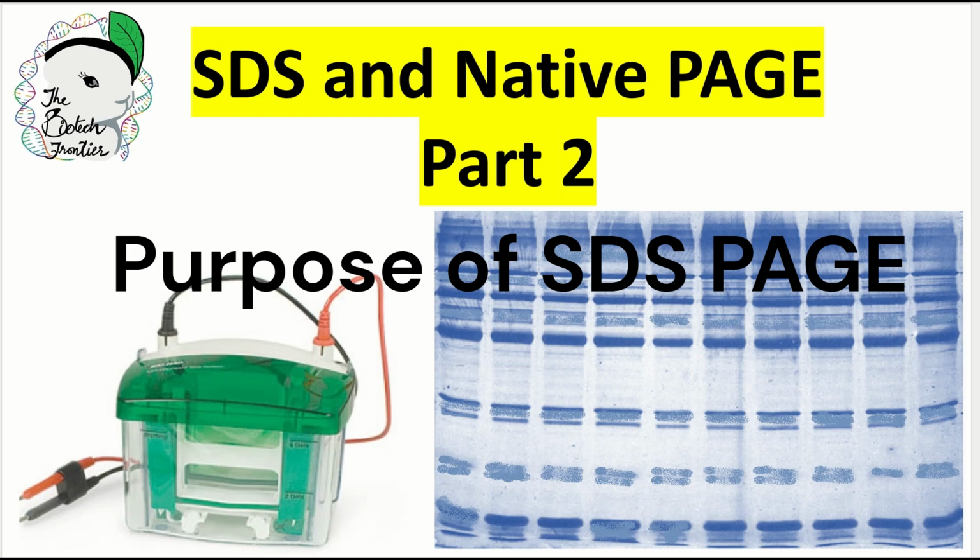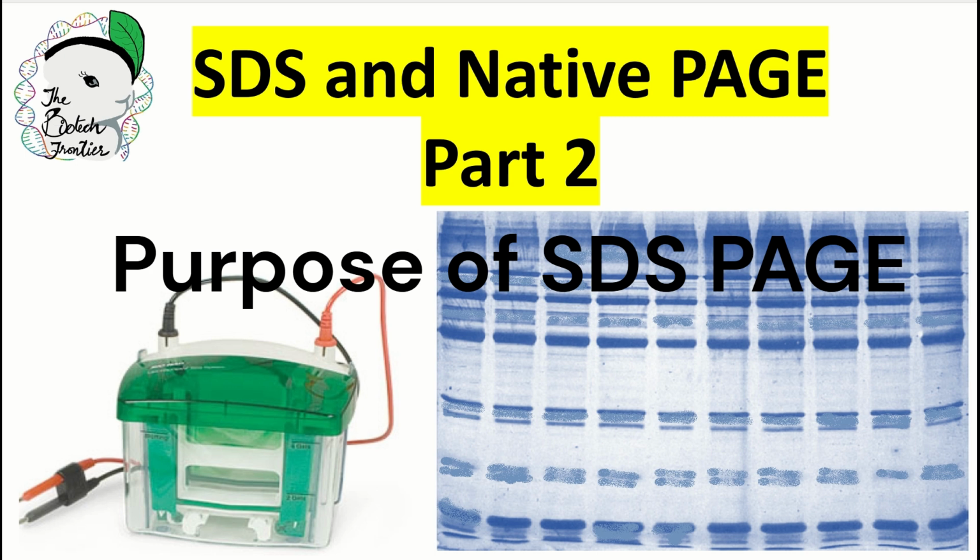So in the last lecture, we discussed PAGE, that is Polyacrylamide Gel Electrophoresis, what these gels are made up of, and how proteins are separated on the basis of molecular size on these types of gels. We have also discussed the basic differences between SDS and native PAGE. Today, we will focus on the purpose behind performing SDS as well as native PAGE. So let us start with SDS PAGE.